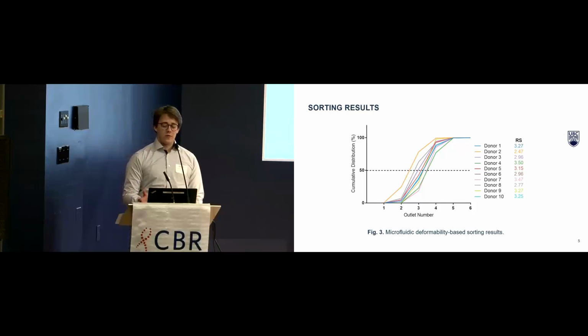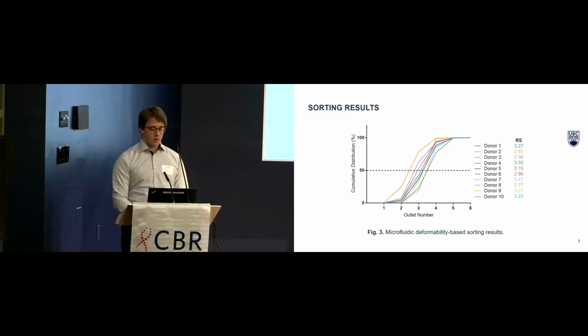Here we show the microfluidic deformability-based sorting results. This plot displays the cumulative distribution of the sorted cells. We observe donor-specific deformability patterns, and these are quantified at the 50% crossover frequency, termed the donor's rigidity score, or RS.